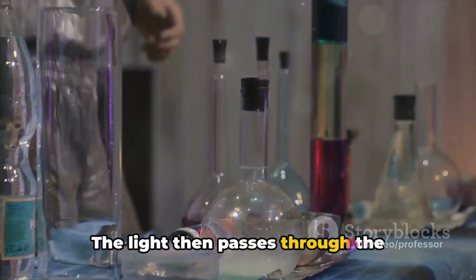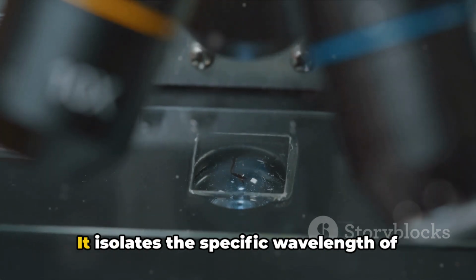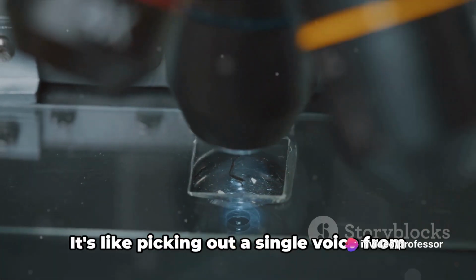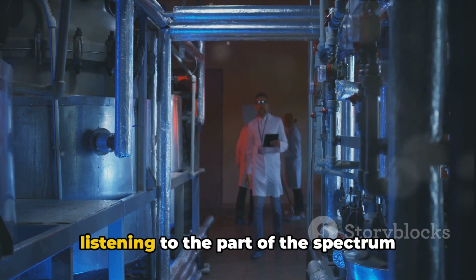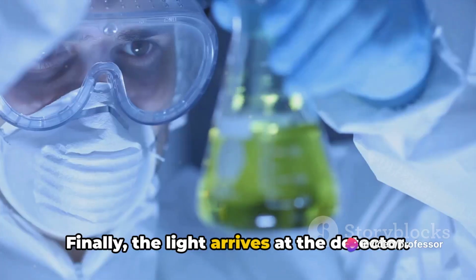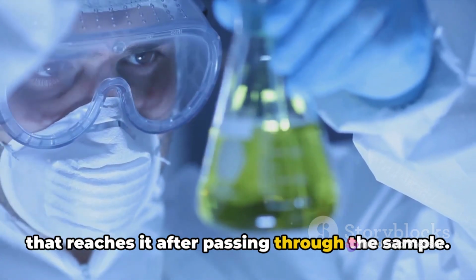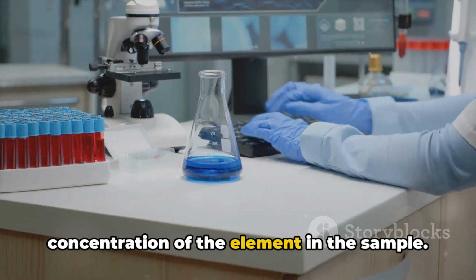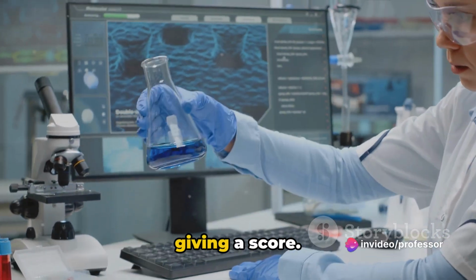The light then passes through the monochromator, our third key component. The monochromator is essentially a filter. It isolates the specific wavelength of light that will be absorbed by the atoms in the sample. It's like picking out a single voice from a chorus, ensuring that we're only listening to the part of the spectrum we're interested in. Finally, the light arrives at the detector. The detector measures the amount of light that reaches it after passing through the sample. It is this measurement that gives us the concentration of the element in the sample. It's like the judge in a singing competition, assessing the performance and giving a score.